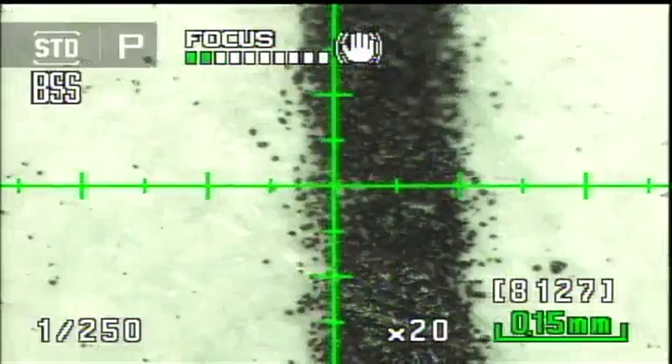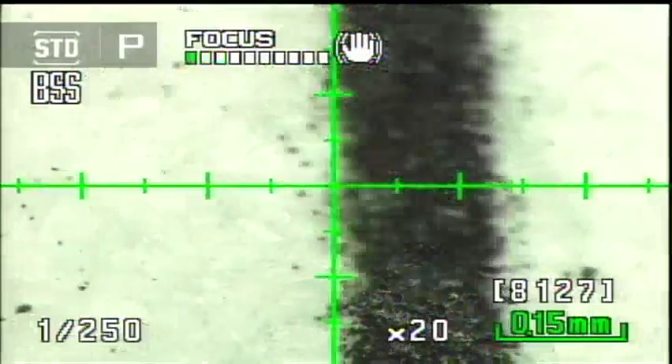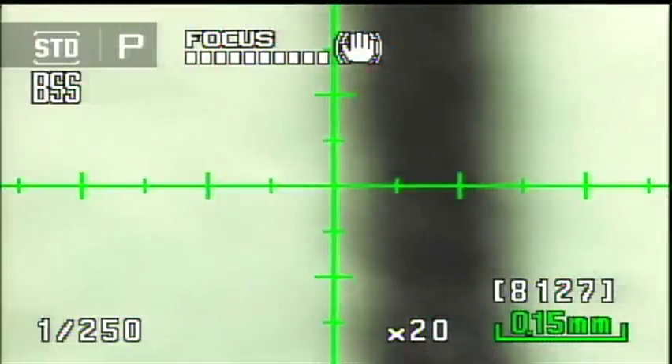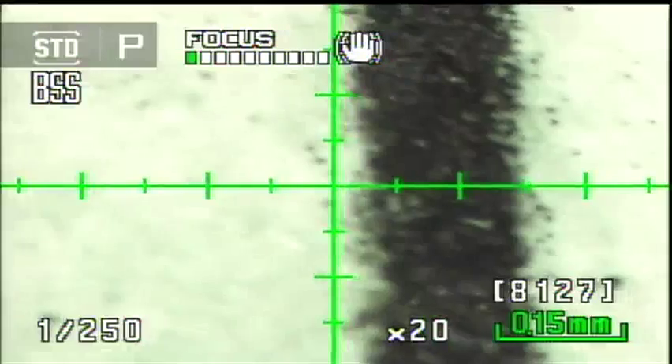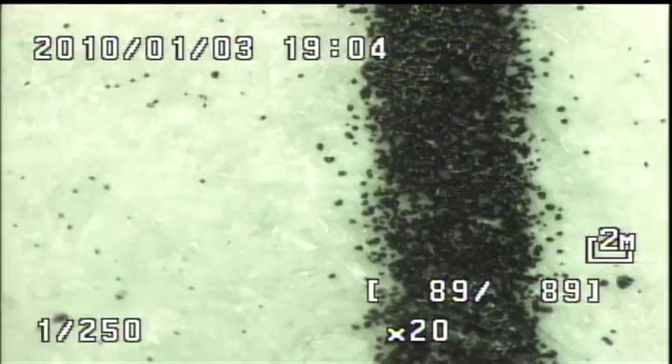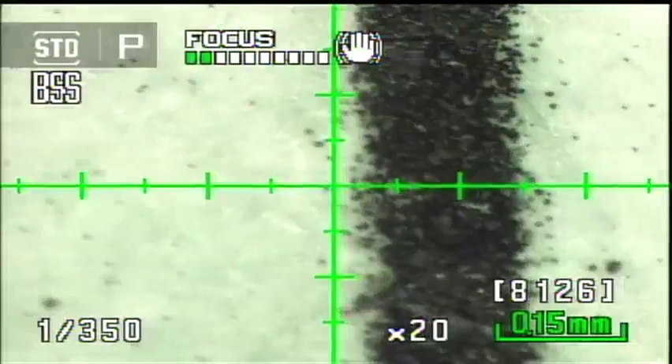Taking a good picture handheld at 20x would be really difficult — except for a special option the Shuttlepix has. When I pull the trigger, it takes 10 pictures in quick succession and automatically selects the best one to save, discarding the other nine. So even though I was wobbling all over the place and in and out of focus, it saved the one good picture.